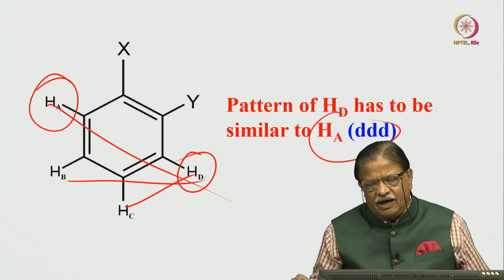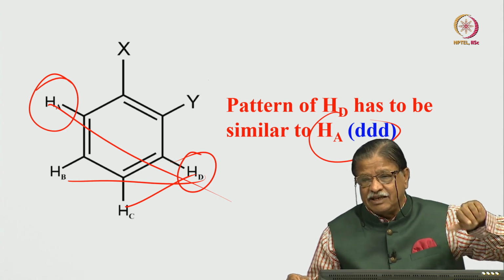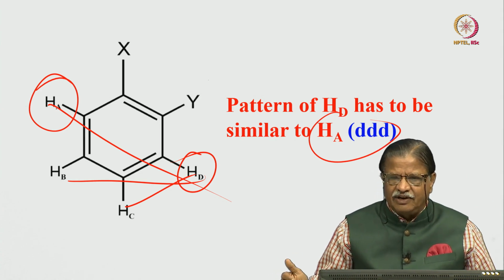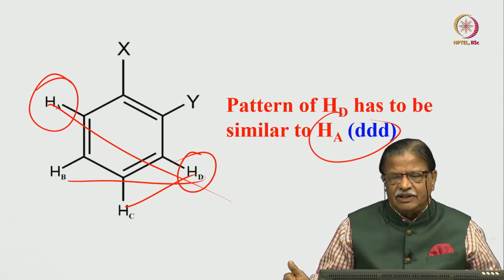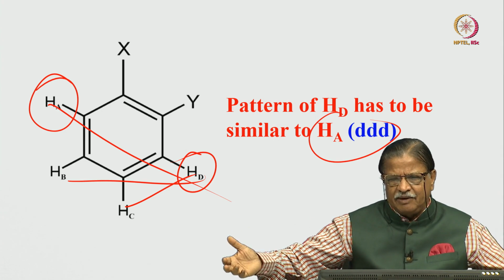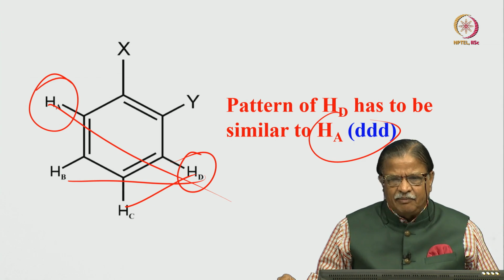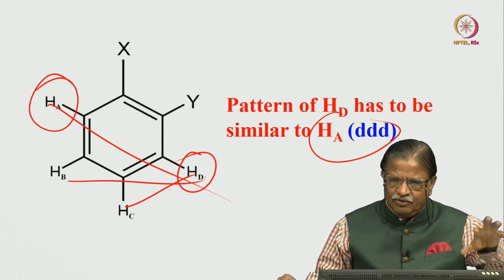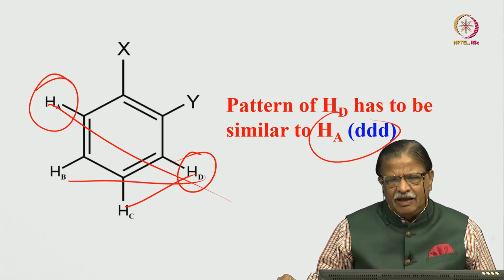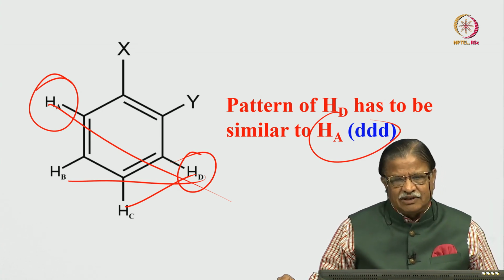For olefins, or ethylenic molecules with a double bond, we understood that depending upon the trans coupling, cis coupling and geminal coupling strengths, we could easily assign which is which. That was not difficult at all. So, we took the example of many such molecules. One molecule can have protons coupled with two protons, three protons or groups of protons, and the multiplicity pattern becomes very complex. Looking at the complexity, we could make rough assignments. By and large they are correct, but how do you authentically say that? We have to go to the higher advanced NMR techniques.